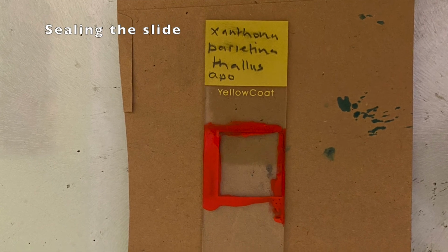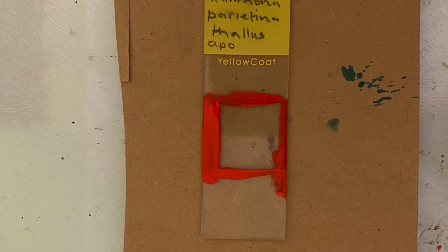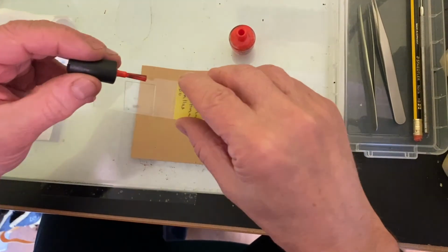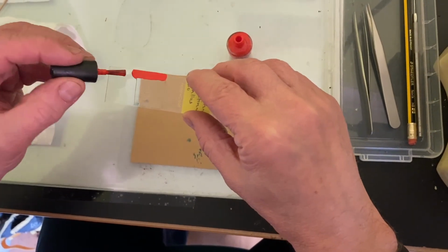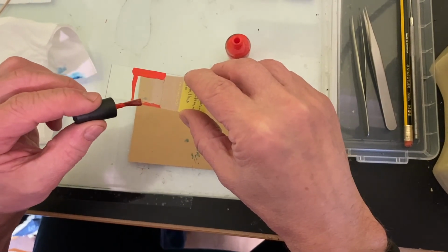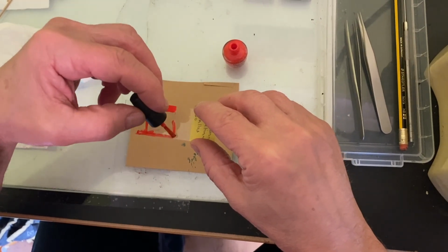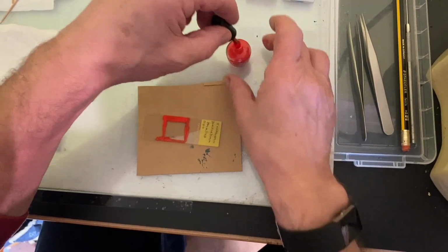Sealing the slide. The ink vinegar preparations are not permanent and will dry out. So assuming the preparation is sufficient for further examination, to decrease the speed of drying, seal the join between the cover slip and the slide with nail varnish. In this case, red nail varnish, but other colours will work fine.